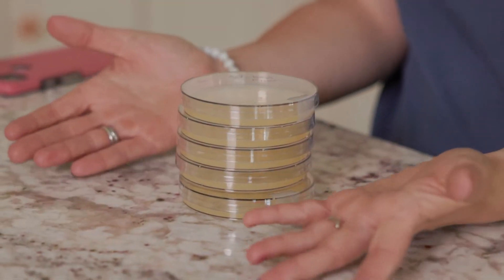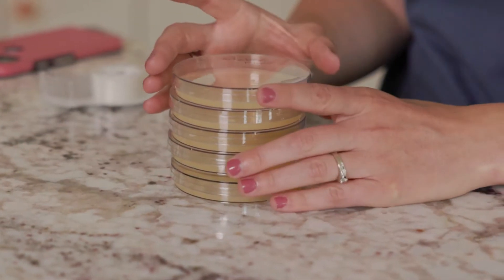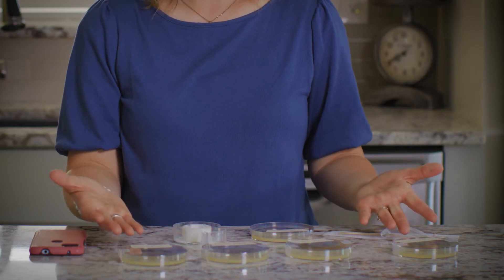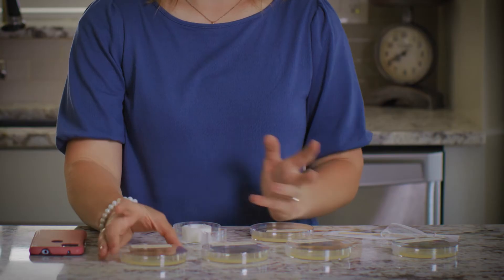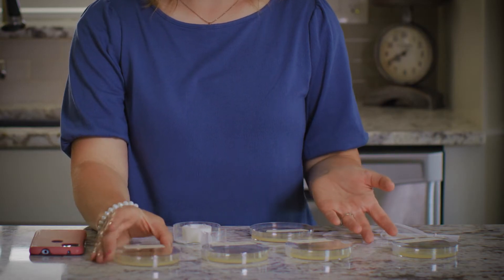For this experiment, you will need five agar plates. You can buy agar plates already prepared like these, or you can make them yourself. Either way works just fine. I'm going to use these five agar plates.